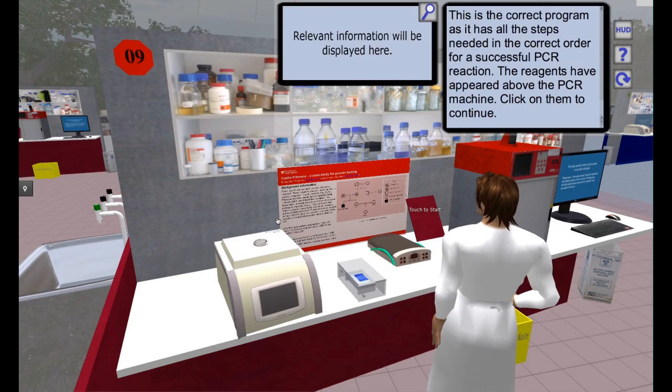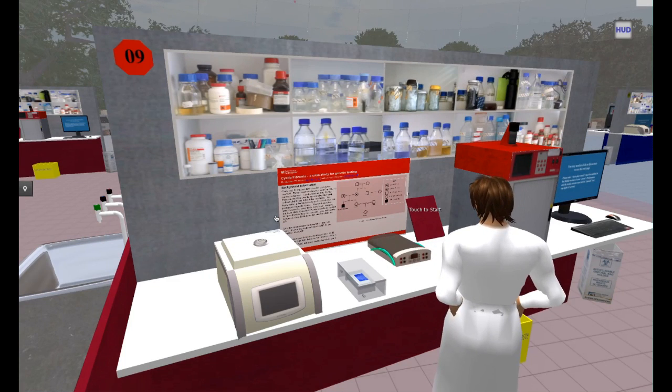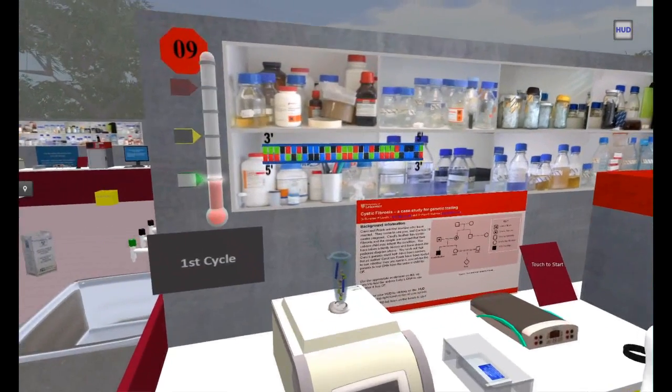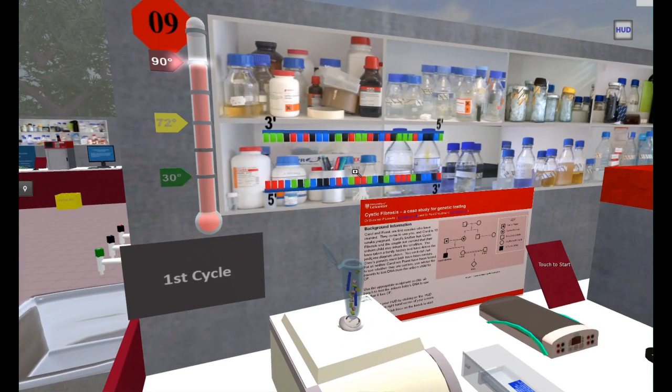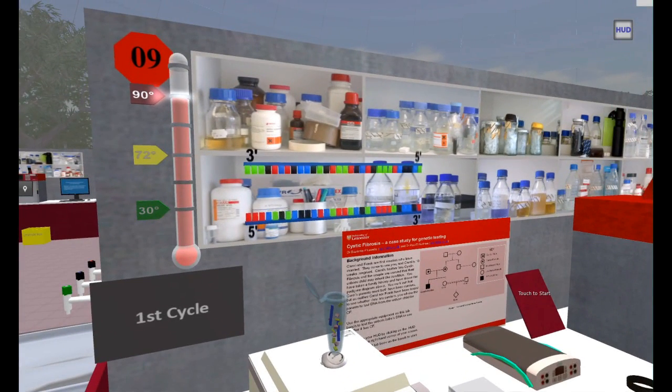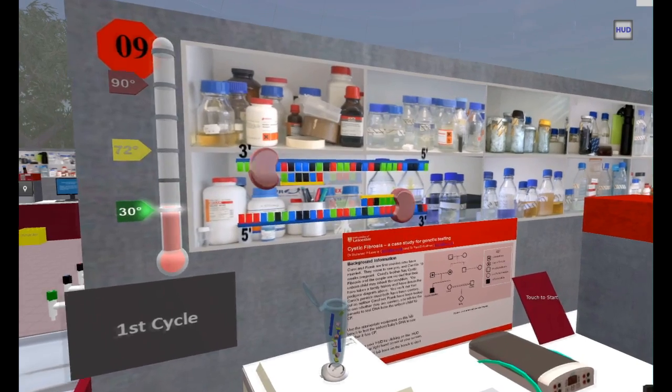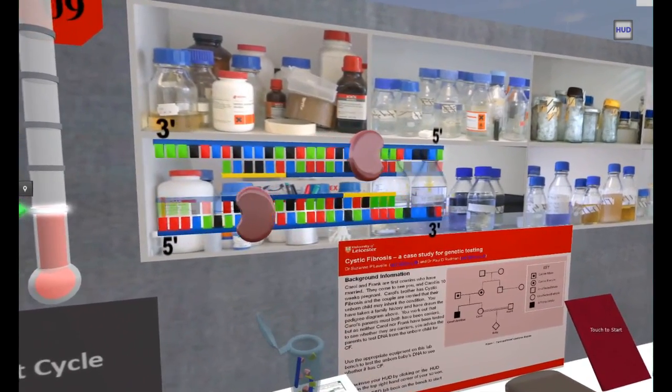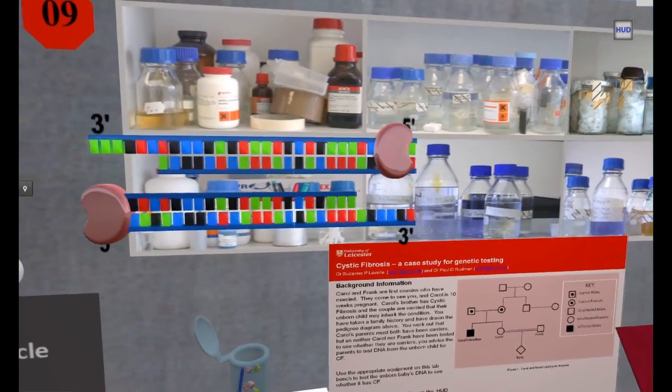But here, we go beyond what the real labs can do. As the virtual machine runs, students see a 3D animation showing what happens to the molecules inside the machine. This is theory they've already studied, represented in context.